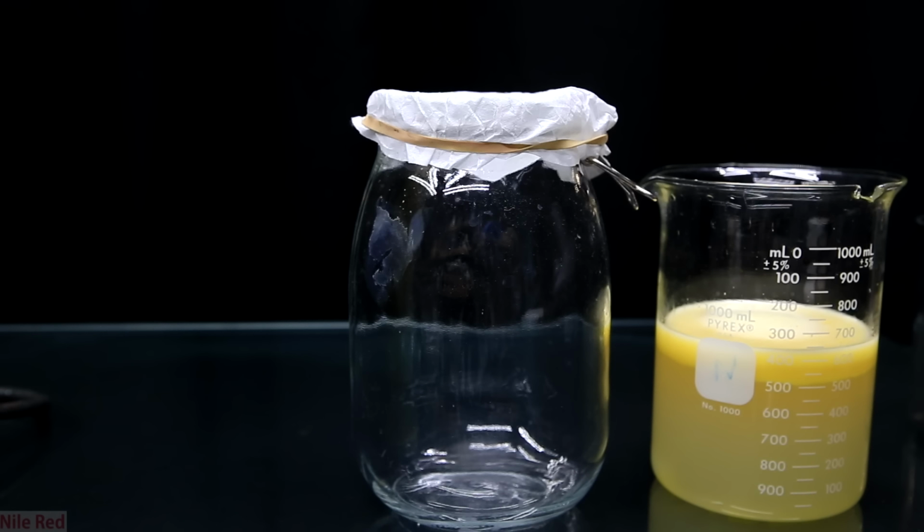After letting it stand for a bit, you'll notice the stuff at the top is no longer orange and it's also yellow. This yellow color serves as our endpoint to tell us that we've added enough sodium hydroxide. The iodine is strongly colored, but when it's in its salt form, sodium iodide, it's colorless. So when the red color and orange color are gone, and we're left with just this yellow color, we know that we've converted pretty much all of our iodine into sodium iodide.